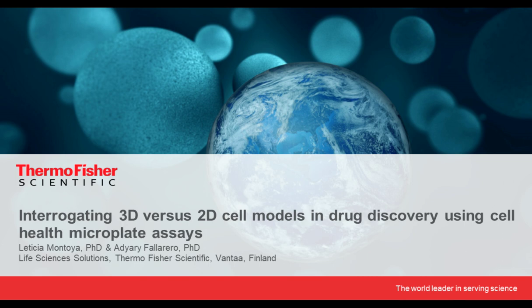Well, thank you so much, Michelle, for the introduction. My name is Adyary Fallarero, and along with my colleague Leticia Montoya, we are going to be presenting today a number of results that will reveal what are the main critical points that you have to take into account when you are transitioning between 2D and 3D cellular models, and especially when you are utilizing cell health microplate assays. So we are going to focus today on revealing what are the critical points that you should be taking into account.